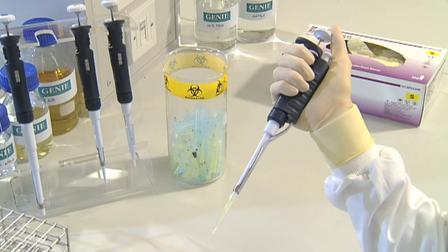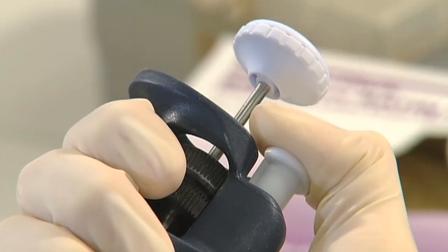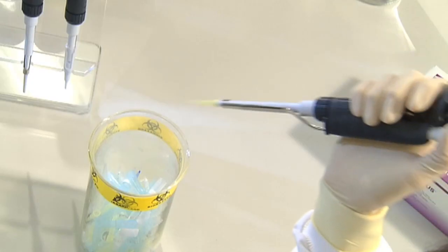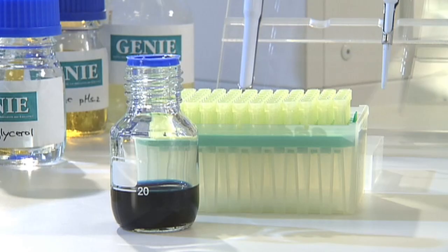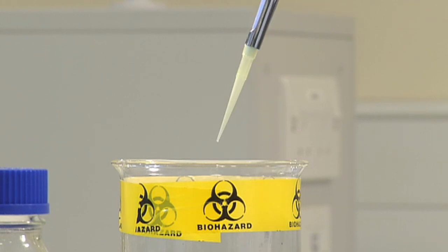Once you've aspirated the liquid, release the pipette tip by pressing down on the tip ejector — the small white button at the top of the main body of the pipette. Be sure the attached tip is inside the appropriate waste container before pressing the tip ejector. A new clean pipette tip should be used with each new liquid, or if the tip touches any surface or liquid other than the one you're pipetting. If in doubt, change the tip.